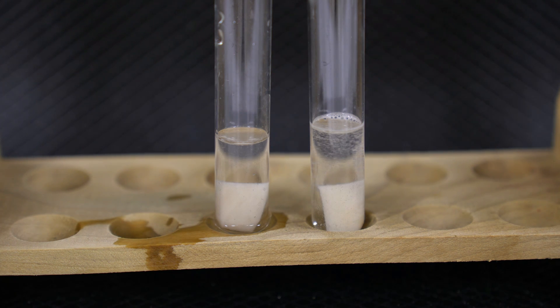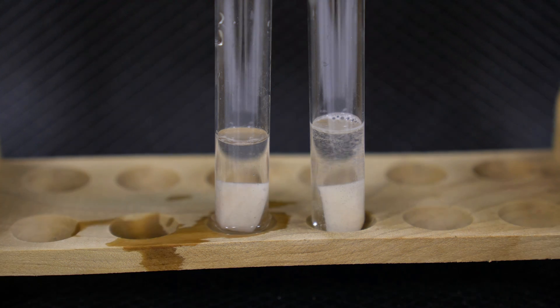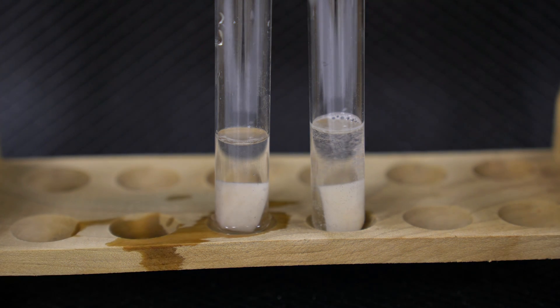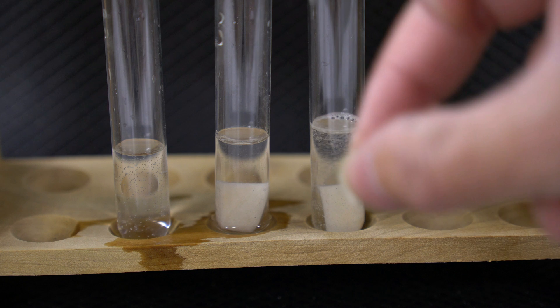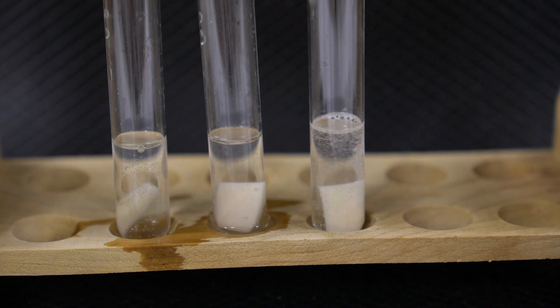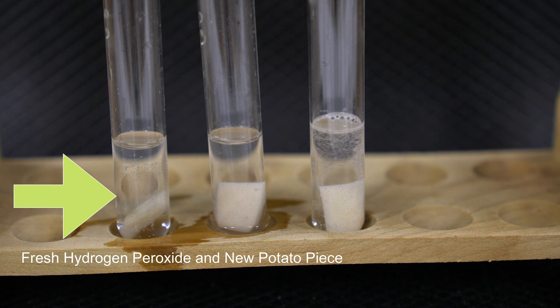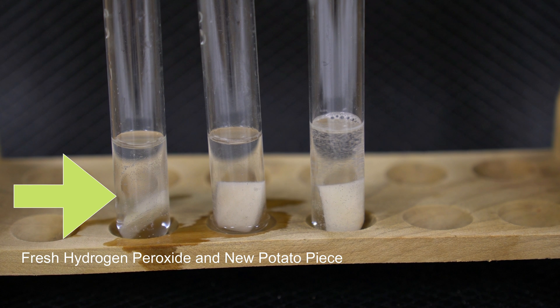So for comparison purposes, if I take that fresh 4 mL of hydrogen peroxide and a brand new fresh potato and add it there, we can see the difference now in reaction rate. It takes just a couple seconds to get going, but we are noticing definitely more bubbles being produced here with the fresh potato and fresh hydrogen peroxide compared to the potato that already went through a reaction.